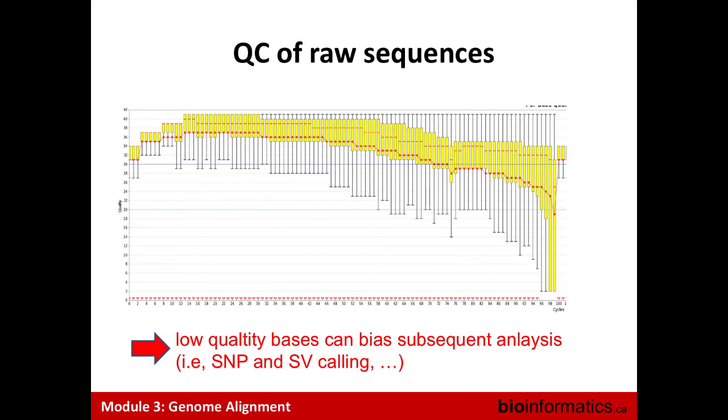For example, the new PacBio Sequel provides data in BAM format. The old one provided data in FASTA and in movies. So you need to do some data manipulation to generate a FastQ file, because most of these tools take a FastQ file as input. So it's the same information, but displayed in a different format. So you have to convert to switch from one to the other.